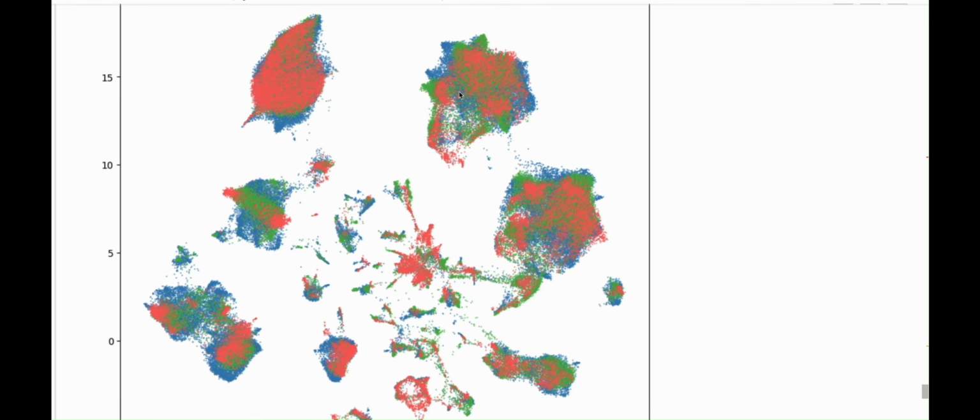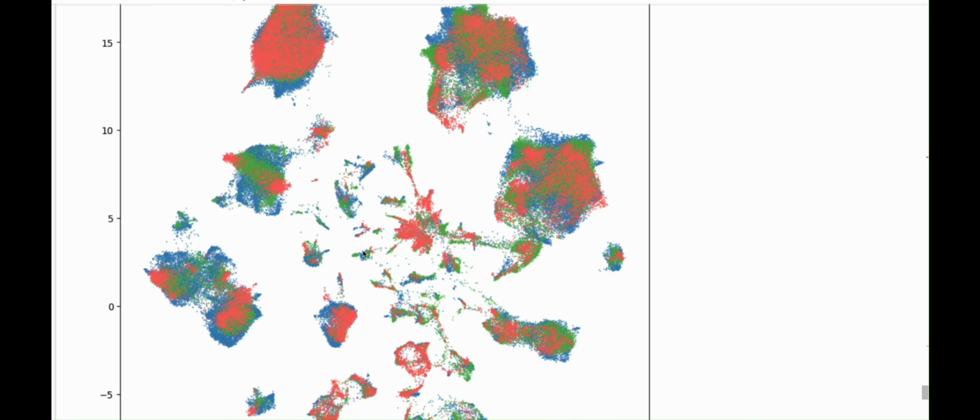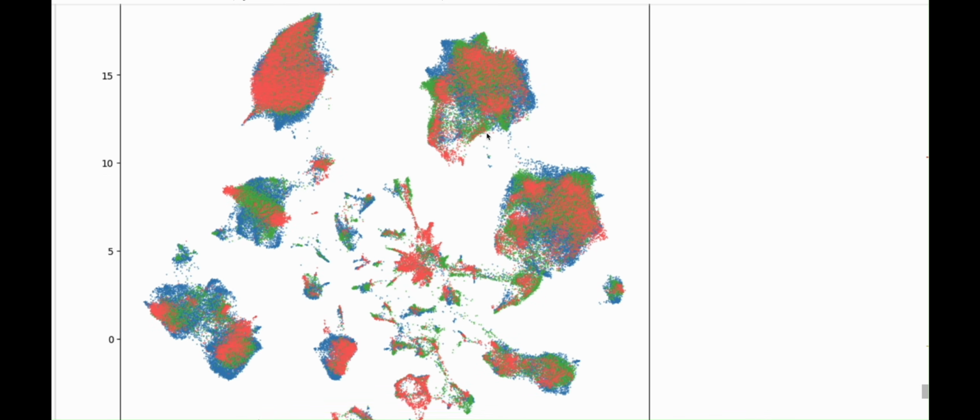If you want a version of this that tells you which color is which, I'll let you in the right corner. Again, the tutorial is ABC Atlas Access for the 10x clustering. For one of the HMBA BG tutorials, we'll have a very pretty plot that will have a legend telling you everything you need to know.